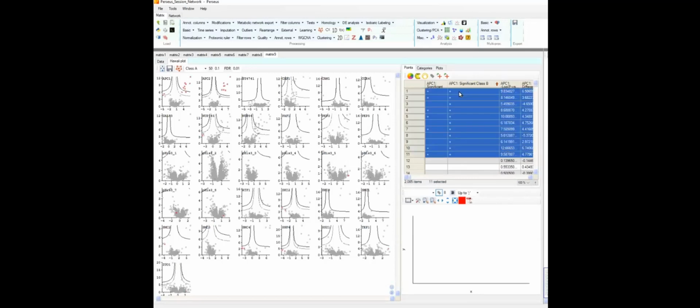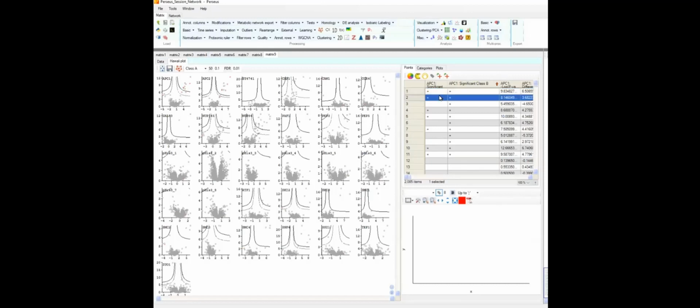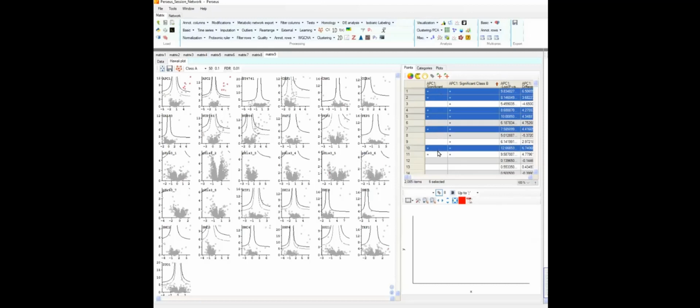Let's just select these proteins. As you can see here, with the FDR, only these were found significant. So let's select only these. To select different rows, just press Ctrl and then the row that you want. And here we have these specific binders for APC1.